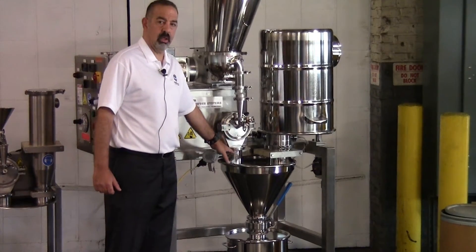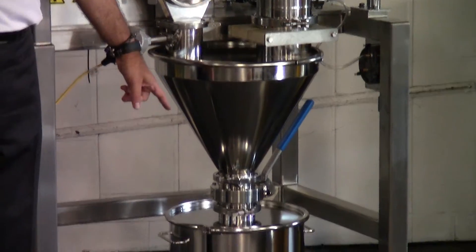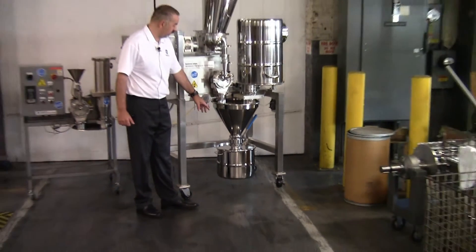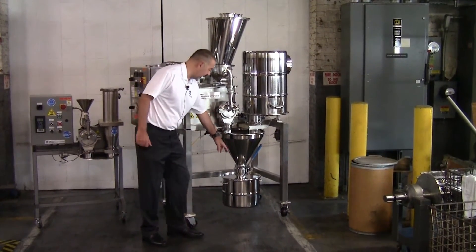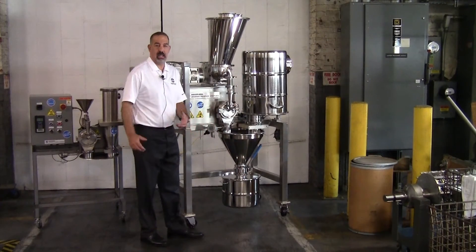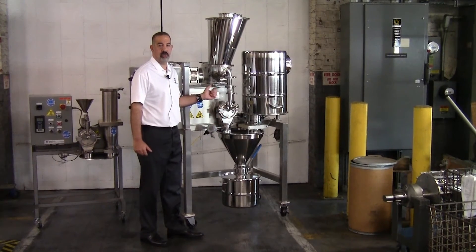Coming out of the mill, what we have is a conical hopper with a butterfly valve going down into a 30-liter container. The purpose of this setup is that during operation, we can shut off the butterfly valve and be able to remove the container and attach a new container, open up the valve, and continue the process without actually shutting the feed down and stopping the milling process.